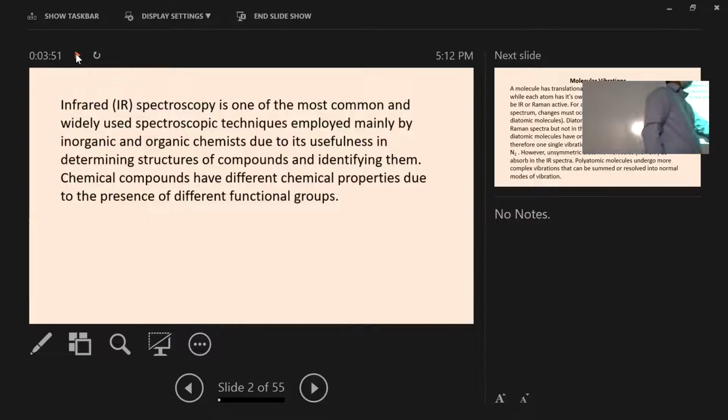If you have a signal in the region where the OH or alcoholic functional group is found, then you can confirm that the structure should be this. If you do not observe it in that region but in another region, that is also represented by this type of functional group. That means this molecule should have oxygen in the ether functional group.